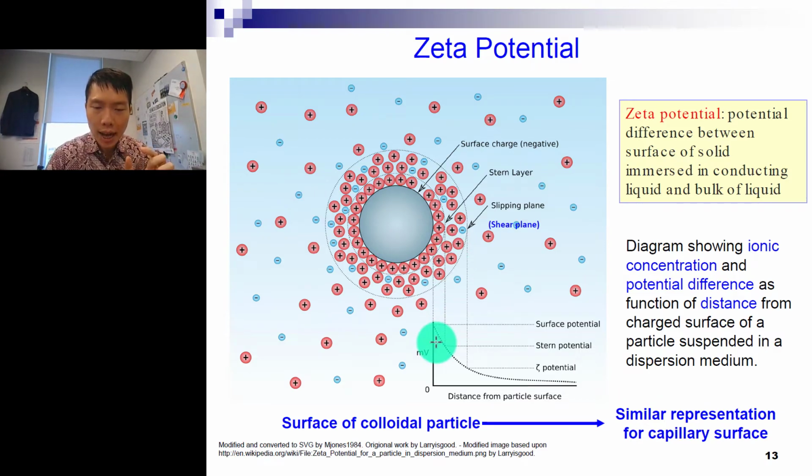So you see the charge is very high on the surface potential. But when the first layer becomes more positive, it will attract a negative charge. So you see some of these negative ions getting attracted, and when you bring in negative charges, the positive charges come along the way. So in the second zone, between the Stern layer and the shear plane, you have a mixture of cations and anions, and this is very mobile, still moving. At the edge of the shear plane, we call this the zeta potential. So there will be a potential difference between the surface potential and the zeta potential.